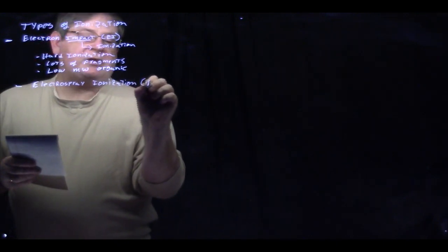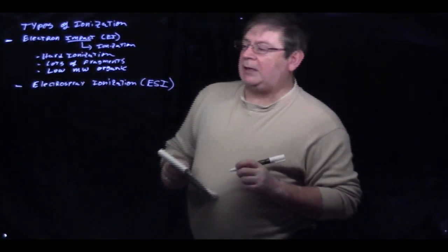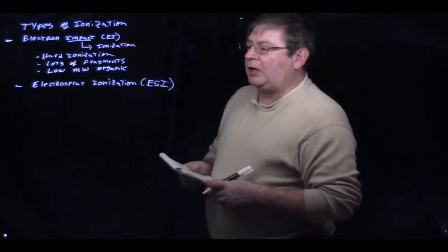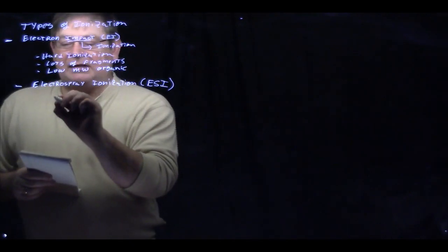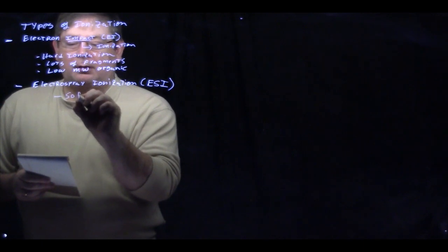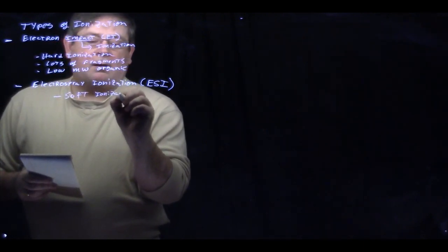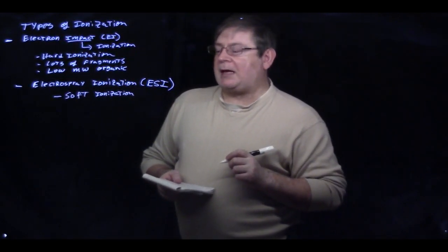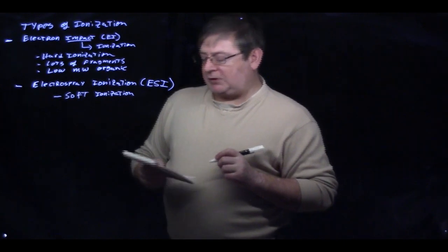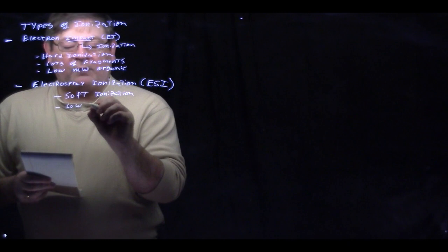Ionization, also known as ESI. Okay, so electrospray ionization is actually a very useful ionization technique, and it is considered soft. It's a soft ionization technique, meaning that once the molecules become ionized, they rarely fall apart into fragments, so you get a very low level of fragmentation.